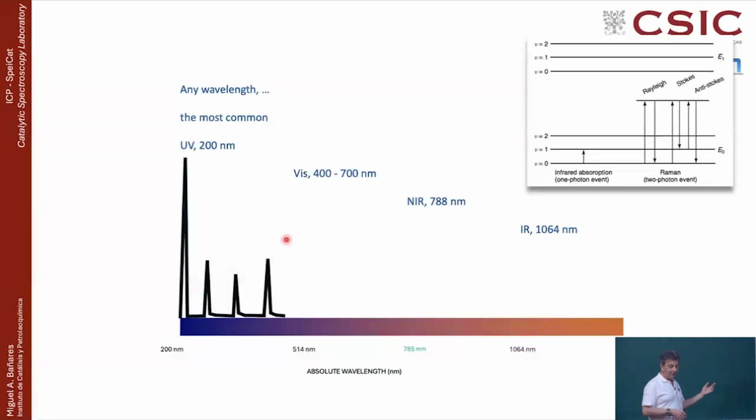So now the slide that I was expecting to see before. What is typically happening when you get a spectrum of a sample, and we are only going to look at the Stokes, which is where you really get more information than in the anti-Stokes, which will be the same but weaker. So basically, this is the laser, UV laser, very intense scattering of it. And then you get the Raman signal, for instance, these 1, 2, and 3 peaks, which appear at a given distance from the laser. Of course, this peak is like 10 million times higher than this one, but you can imagine that if I make it to scale, you see nothing down here. But these peaks appear at a given distance from the laser.